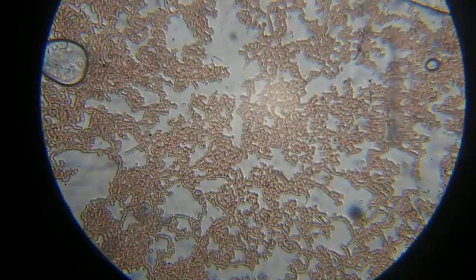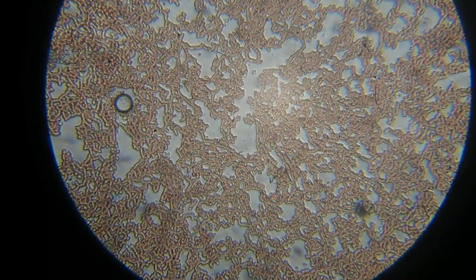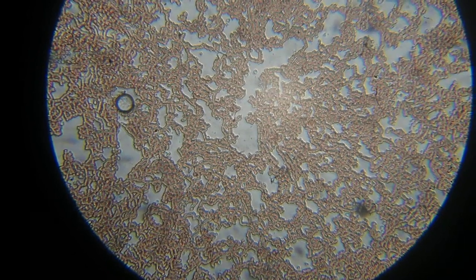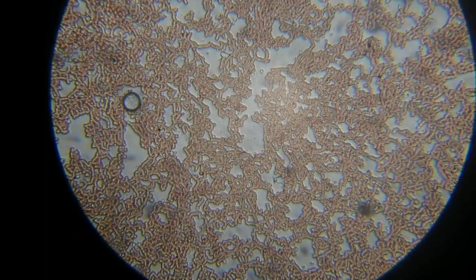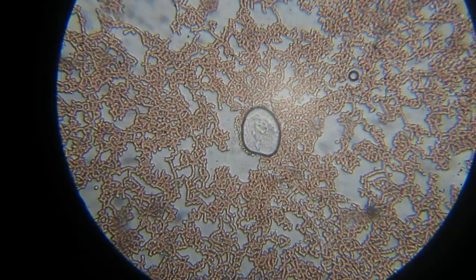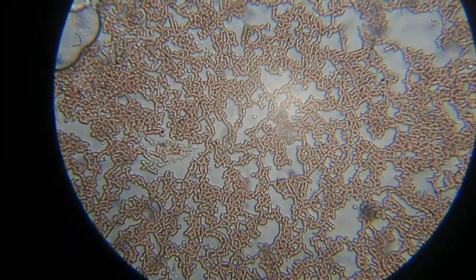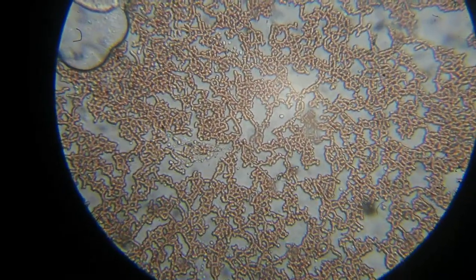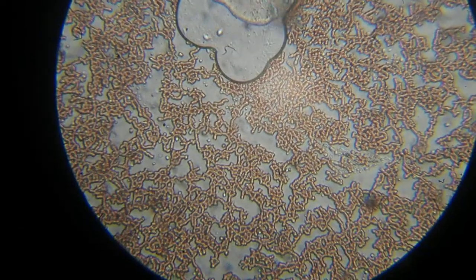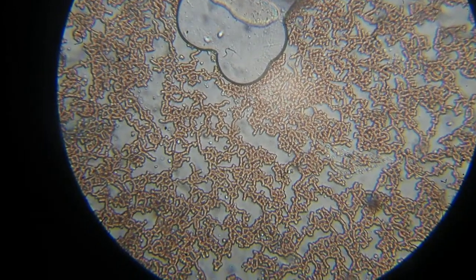Now the last one is Eosin Y, which is supposed to stain red blood cells, which look like little rings actually. So, does my blood contain the equivalent of red blood cells? Spoiler: yes, apparently it does. Actually, I've seen red blood cells doing my initial experiments like 2 years ago, but I didn't stain them then.